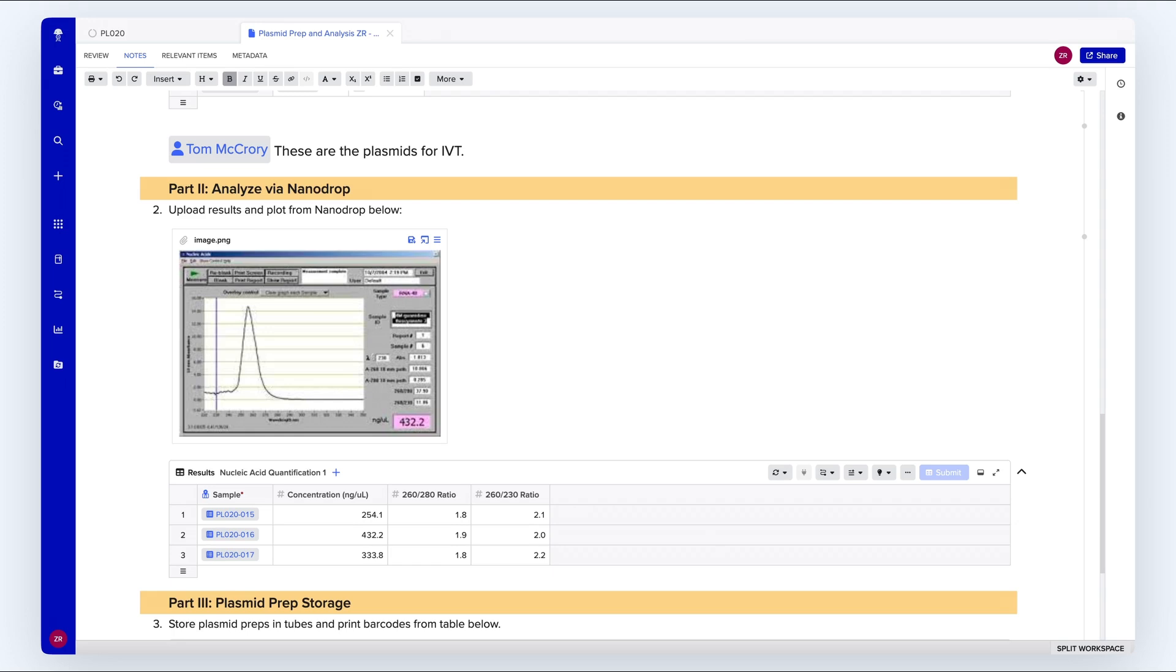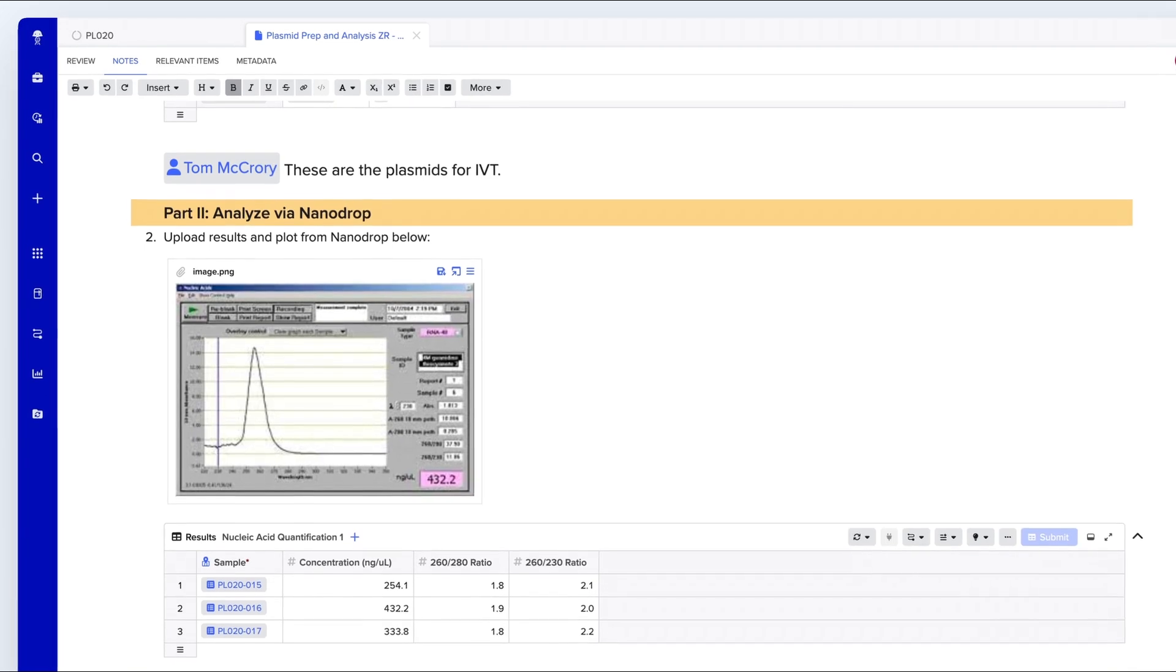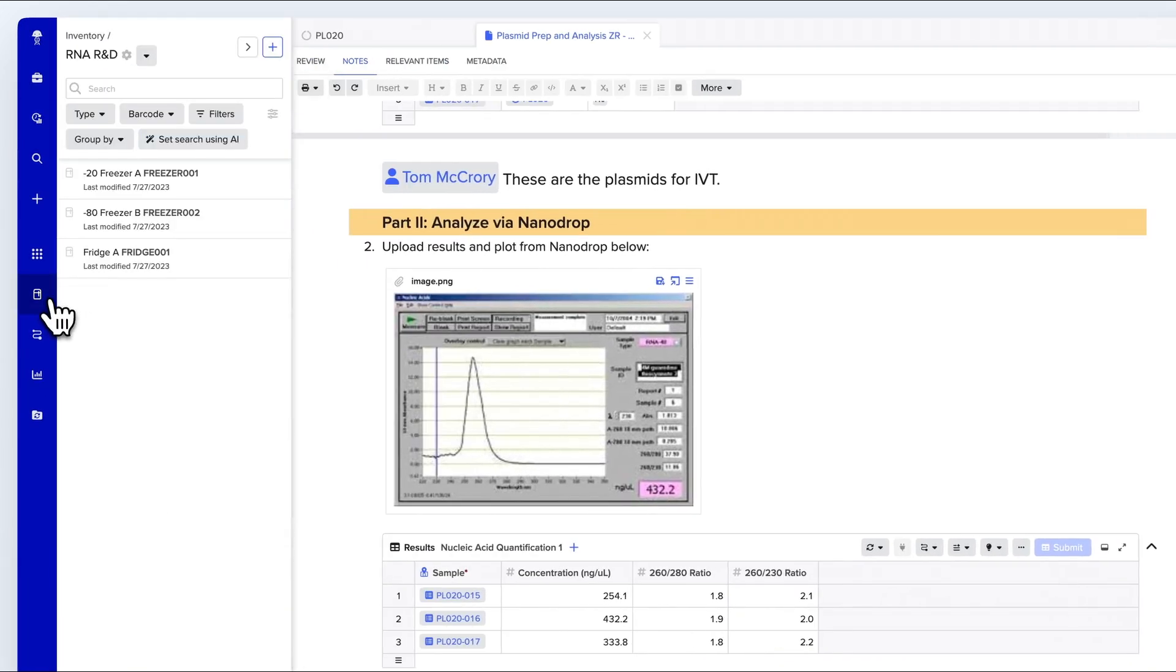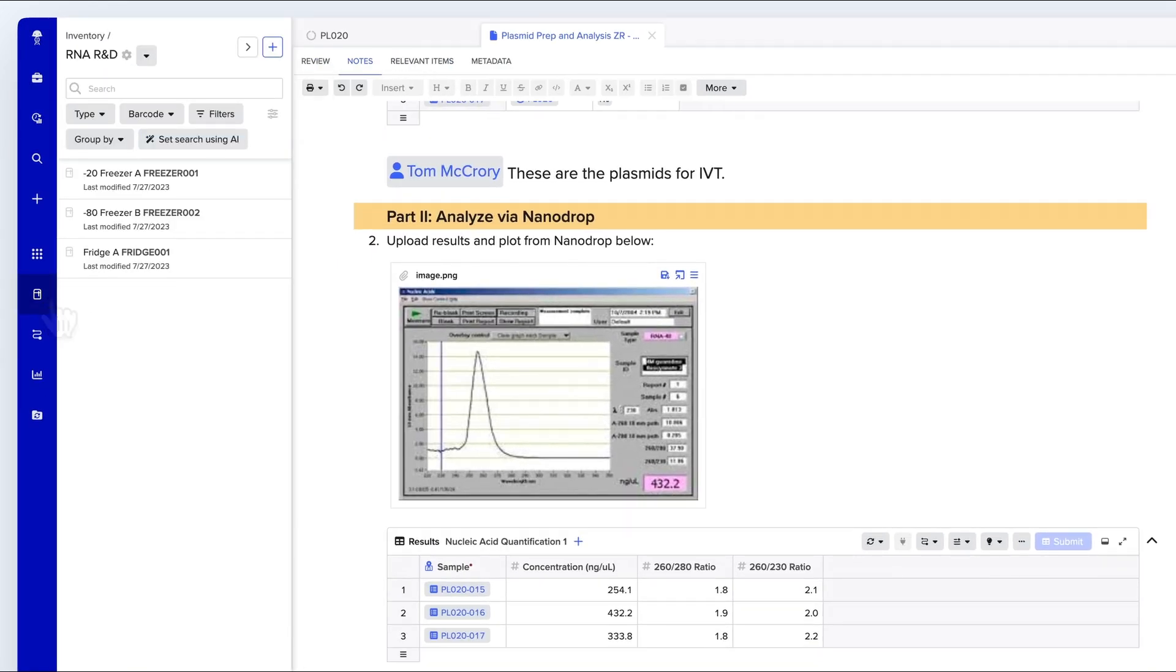Next, we'll look at how Benchling BioResearch helps increase the efficiency of inventory management and sample tracking. With Benchling BioResearch, you can define inventory hierarchy, model relationships between entities, samples, and lots, track locations and quantities of samples with full traceability, and connect physical samples with experimental context.